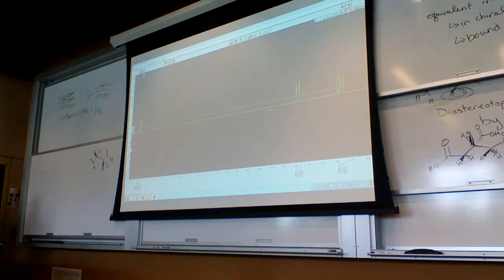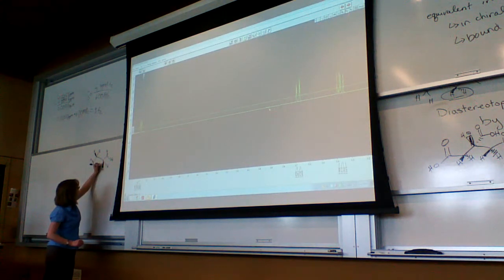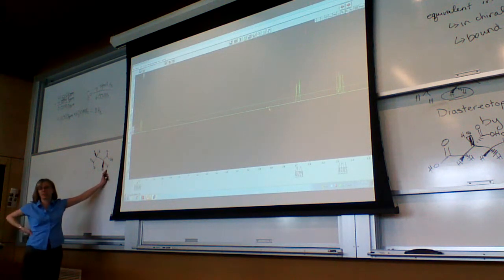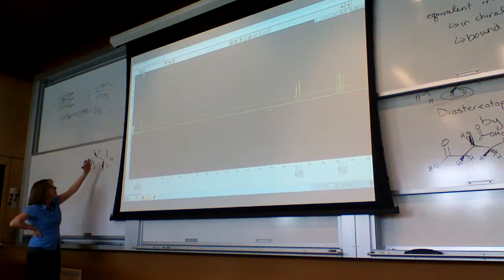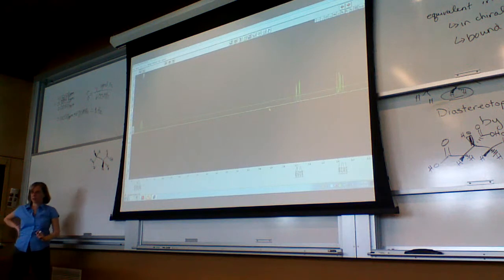Based on the chemical shift, which of the protons of the molecule am I looking at? Carbon as the OH. So we're looking at this hydrogen that's next to the OH, because the OH is going to be de-shielding. Both of them happen to be next to carboxylic acid, so that part's equivalent, but the OH there is de-shielding even more and moving it to the 4 region. So we're looking at this proton right here.